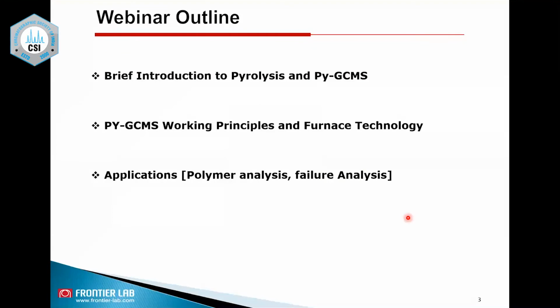My talk outline: I will briefly introduce pyrolysis as a process, and also the instrumentation for pyrolysis GCMS. Then go a little further with the Py-GCMS working principles, also the furnace technology, what is out there and how we are different from the other technology. And also I would like to share some of the applications for polymer analysis or failure analysis.